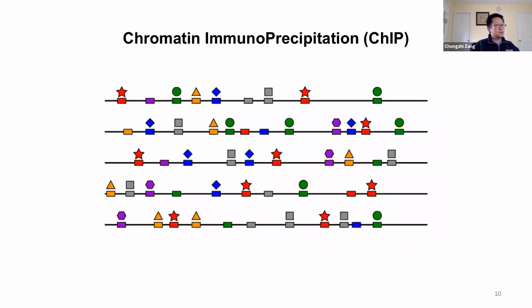So next, I will give a cartoon picture or overview of how a ChIP-seq experiment is done. So what happens in the experimental procedure of ChIP-seq.